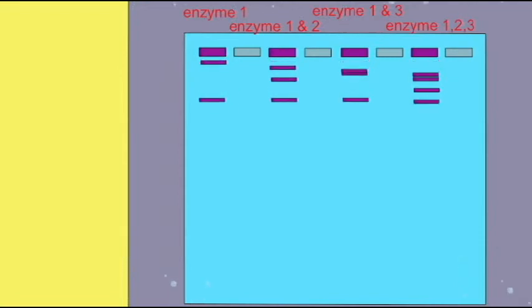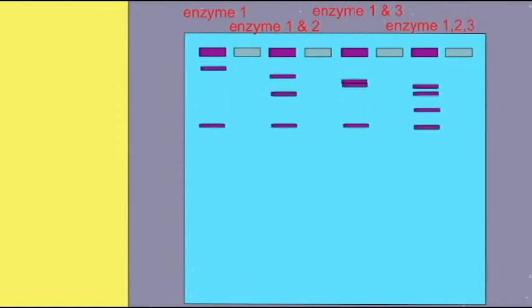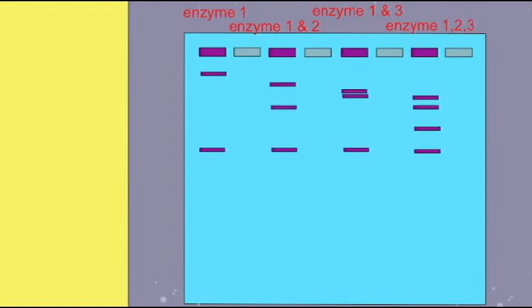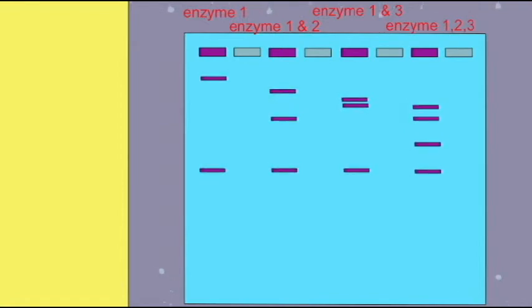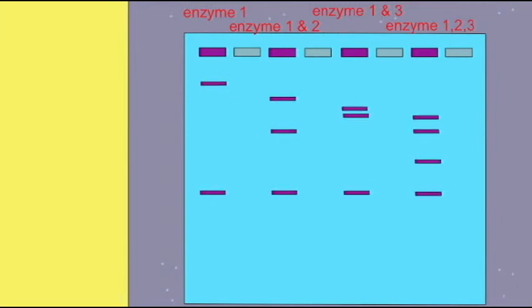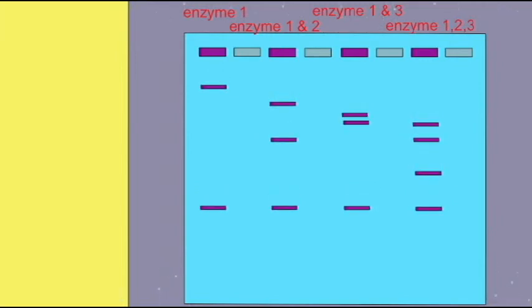It created two pieces of DNA which were unequal in size—one was larger than the other. You can see this by the distance between them. When we combine enzymes 1 and 3, you can see that it also made one additional cut because there once again are three bands of DNA, where originally with just enzyme 1 there were two.